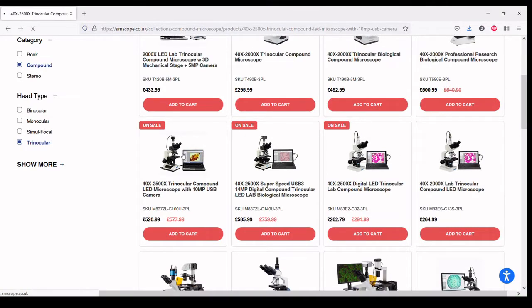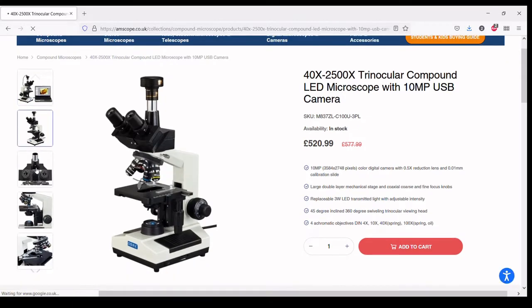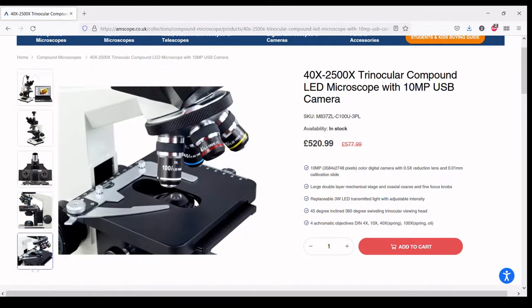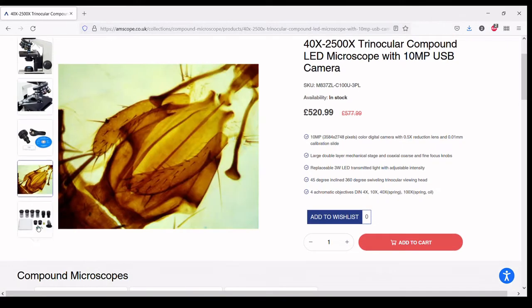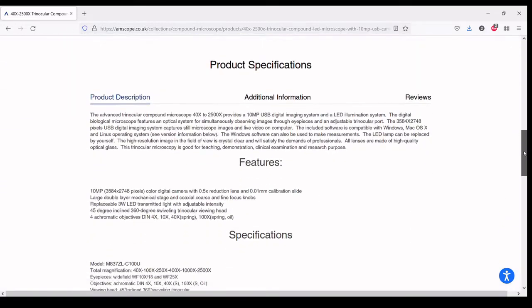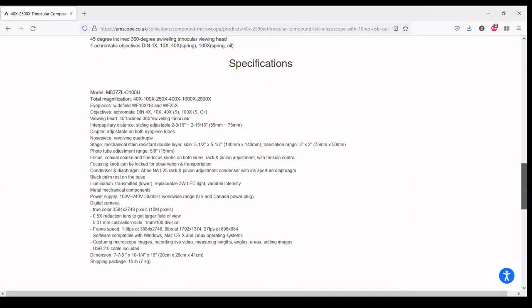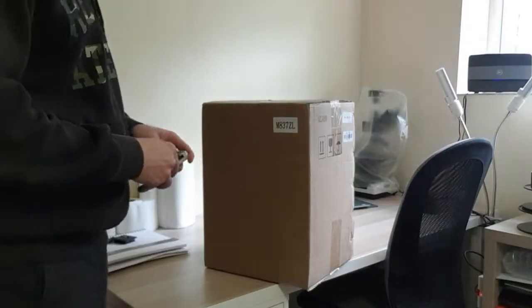Here in the UK they are available for around £520 plus VAT including the 10 megapixel USB camera. What I personally like about them is that they seem to be heavily inspired by an old Olympus CH4. The original is long out of production but the manufacturer did a good job of reproducing it. Let's get started.